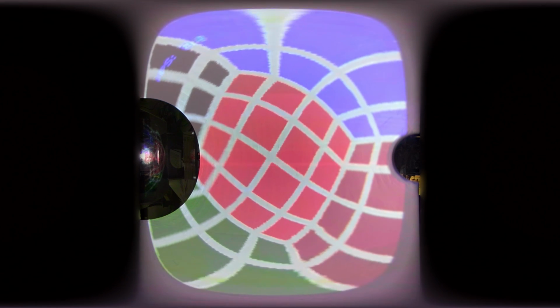In addition to displaying a stationary texture, it can also be rotated online. Not only simple textures can be displayed, many possible sources can be used, such as this natural scene here.